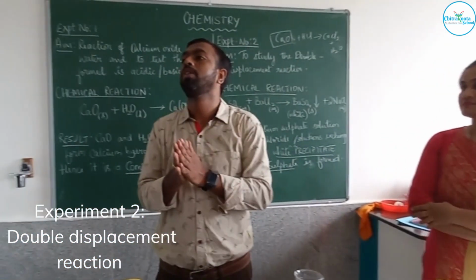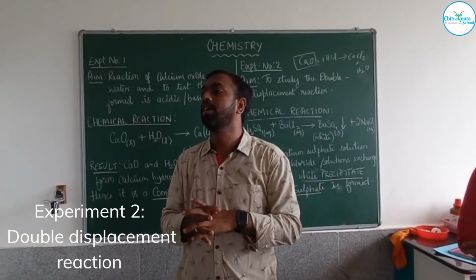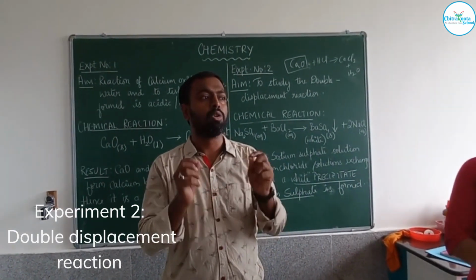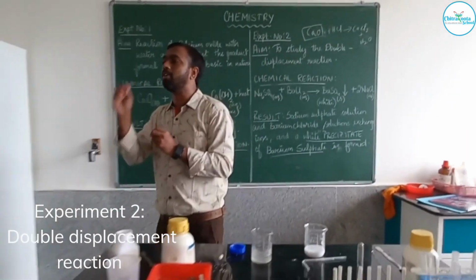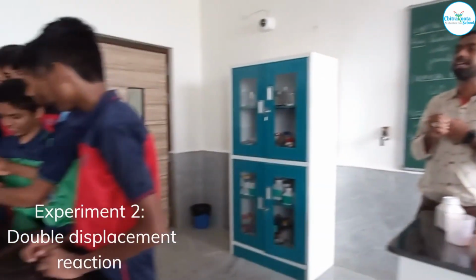Okay. Now it is your turn, boys and girls. Try to mix both test tube solutions slowly. Don't pour completely. Pour drop by drop and then observe the color change.